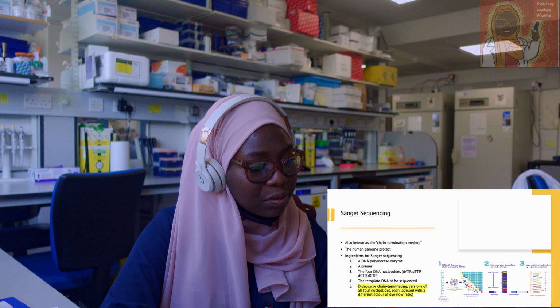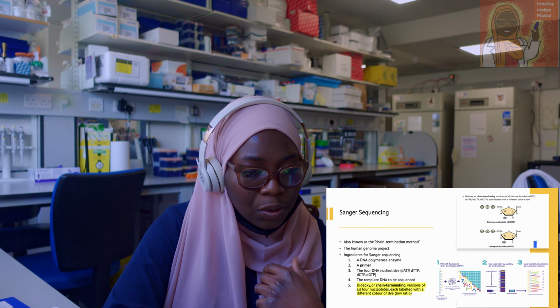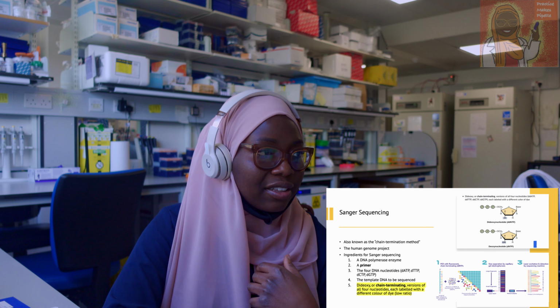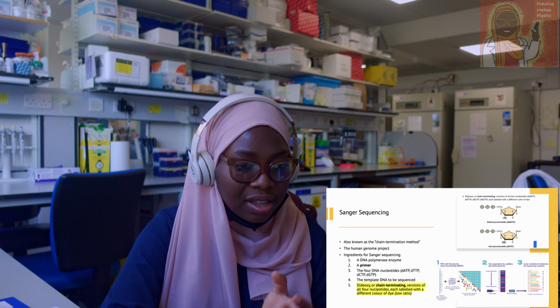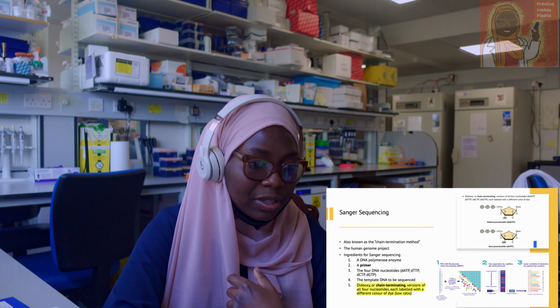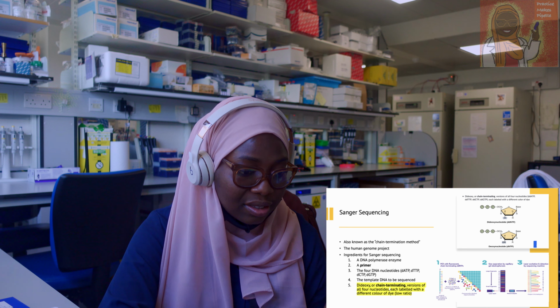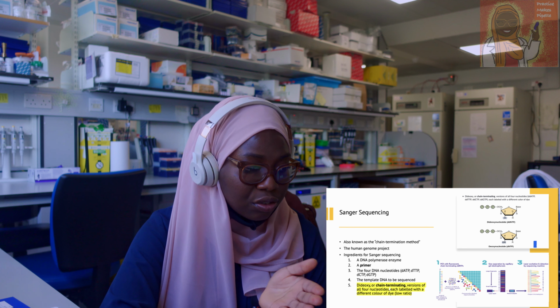And the interesting part about Sanger sequencing is that there is this modified version of the nucleotide, which is the chain terminating version. The normal nucleotide has this OH group here, and this OH group is the one that is involved in the phosphodiester bond that connects one nucleotide to the next nucleotide. So the change that this nucleotide has is that instead of having the OH group, there's the H group, and this H group makes it a terminating nucleotide. So once this nucleotide is incorporated into the sequence, the chain stops, and therefore you can't continue the elongation.